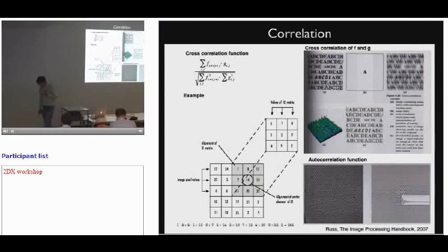There is one other function that is also a correlation function, also fundamental in electron microscopy, that we basically use all the time. And again, there are two ways of looking at this. One of them, which is more intuitive, I guess, is the real space scenario, where we basically have two images. We want to correlate them, basically see how similar they are.